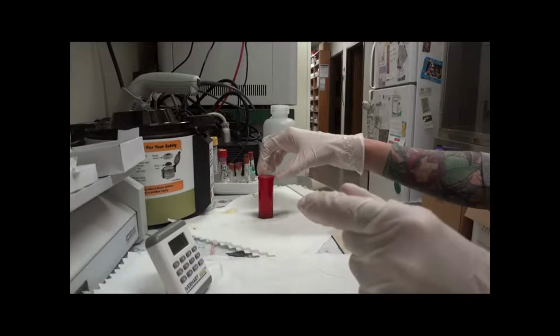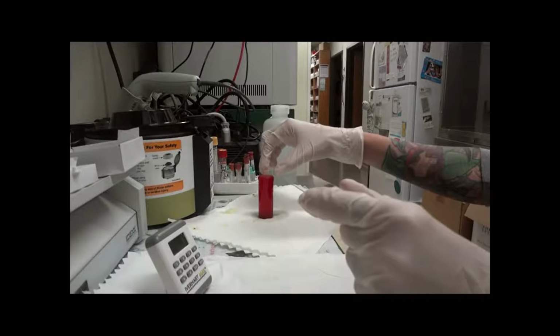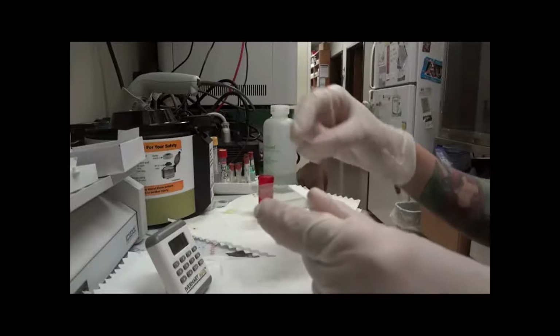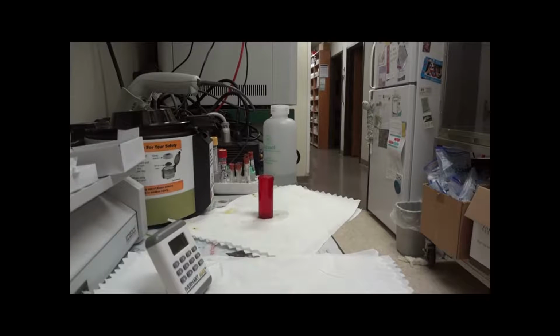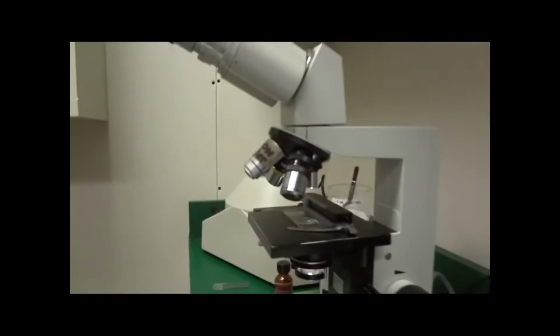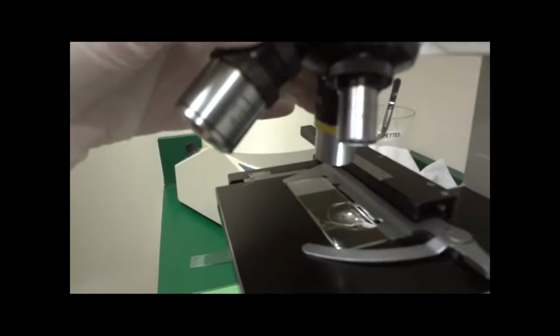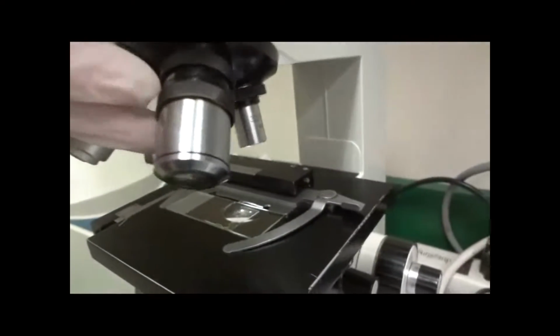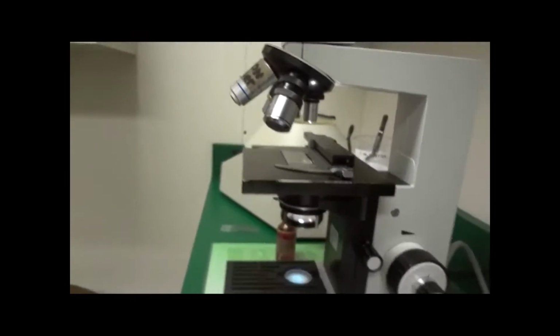At 100x magnification. We want to make sure that we're lifting straight off and right onto the microscope slide. Alright, here's our microscope. We're at 100 magnification there. We can go to the 40 or 400 magnification when looking for specific parasites, such as coccidia, that are much smaller. Alright, our fecal is actually positive for whipworms.